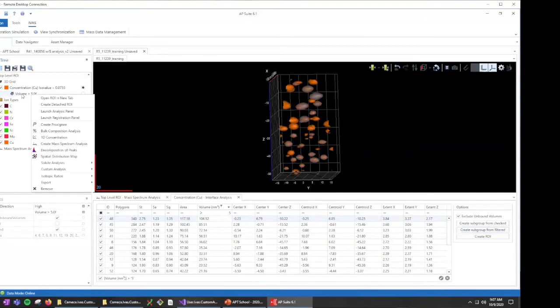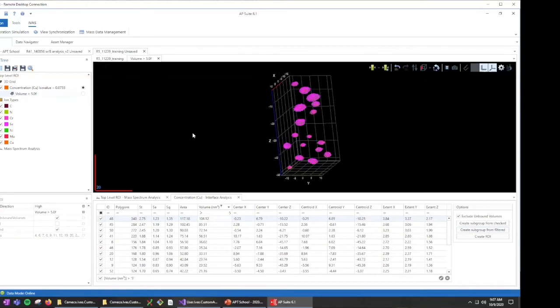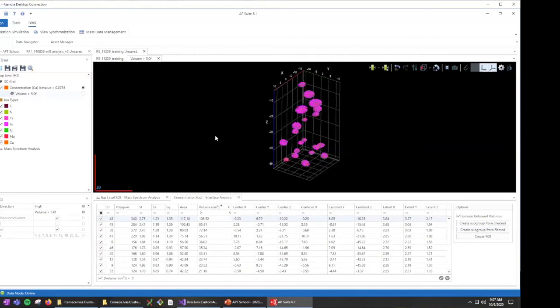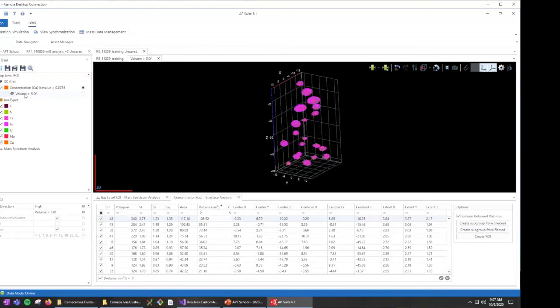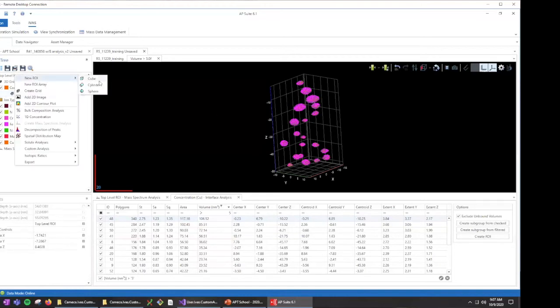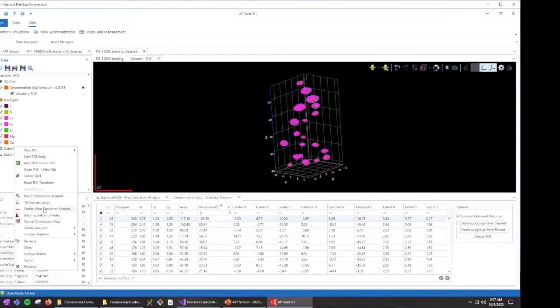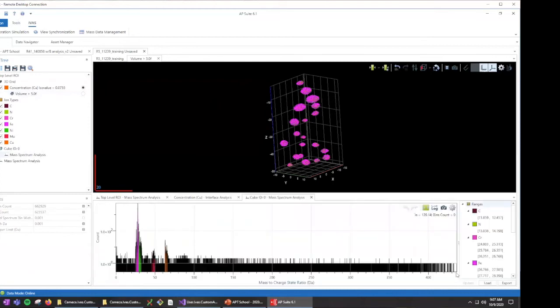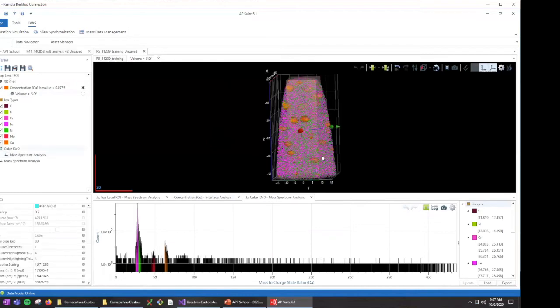One thing you can also do here is open in a new tab, and this will show you just the ions that are inside of that surface. So if anybody knows anything about this new spatial ranging feature, you'll know that basically you can go for any ROI. I'm going to do a really quick demo here. I can make a new mass spectrum, and then in this new mass spectrum, I can change the range definitions, let's say in this cube here, which is visible in this tab.